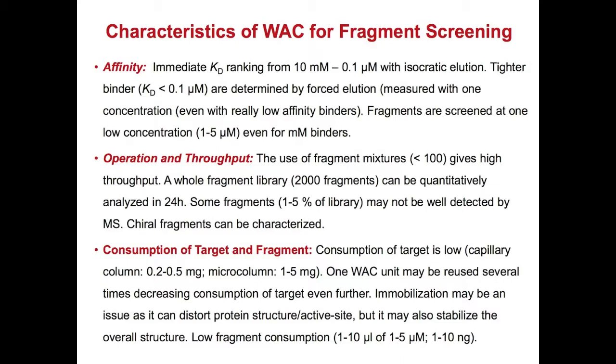Throughput, as we're running in mixtures, we can do fast. A whole library, according to my experience at least, we can do within 24 hours. At least get the ranking. Now we're not including kinetics. Kinetics is another story that would take a little extra time. But we can do that.